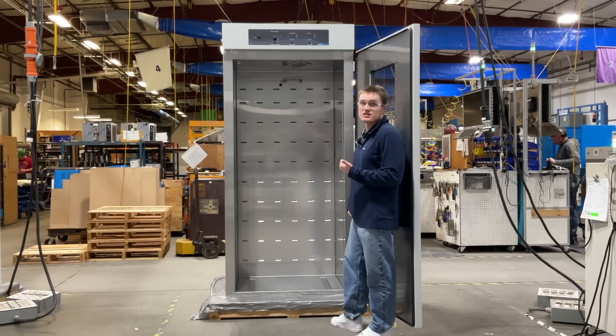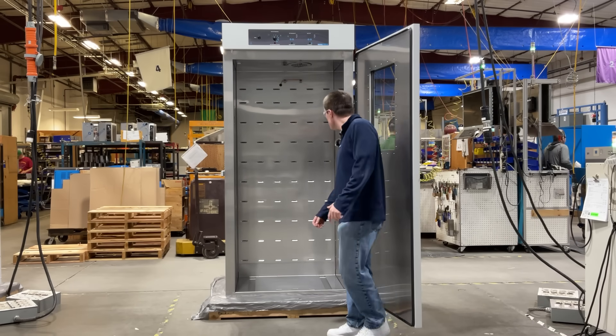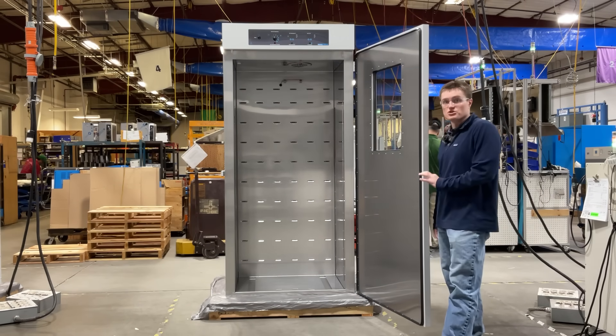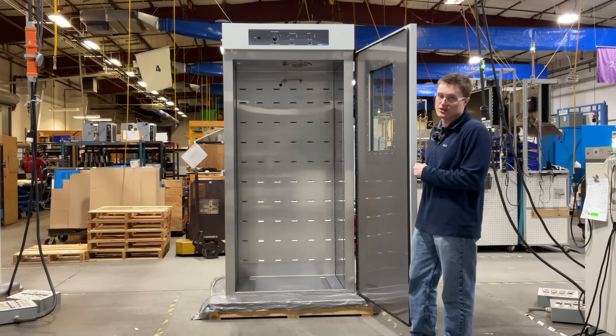For information, please see your user manual or our website. Lastly, you will notice the interior is constructed out of corrosion resistant materials to help increase the longevity of your unit.